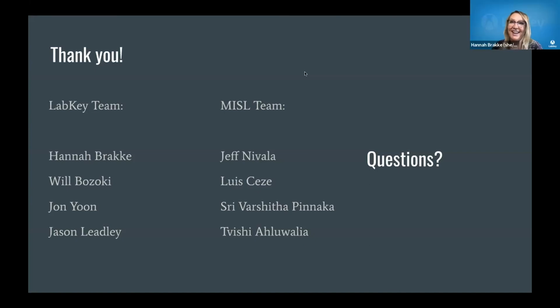Thanks for that. And definitely, I think that is something that we want to end up doing for folks, because that centralization, I think, is really key, kind of as you mentioned before. So I'm going to ask one more question before time is up here. It's going to be one from me. Do you have any advice, Gwen, for the other users today on how to gain adoption of Sample Manager within the lab? Yeah, totally. So that's something that has been an ongoing process, I will say.